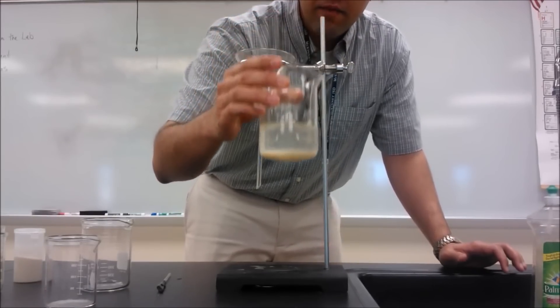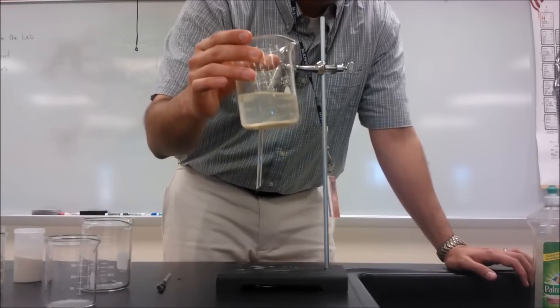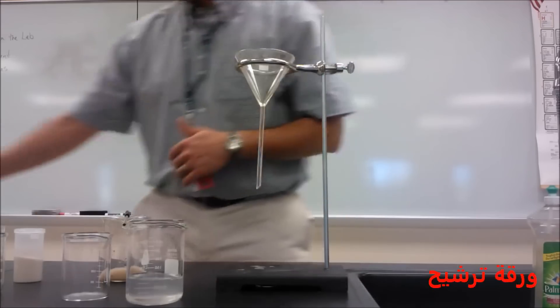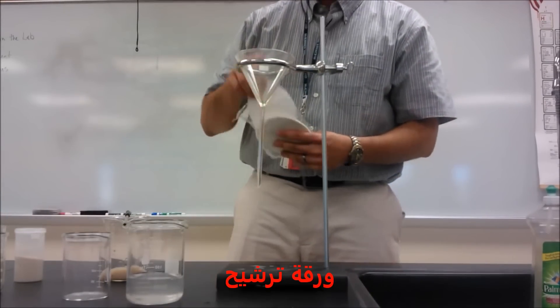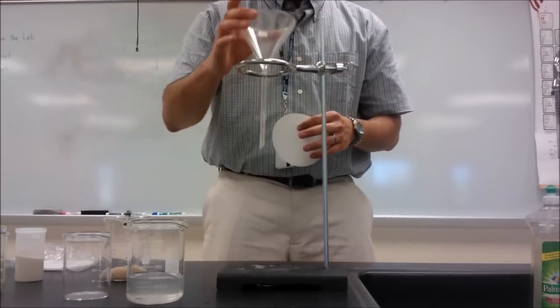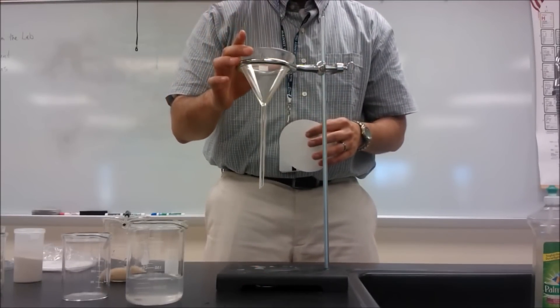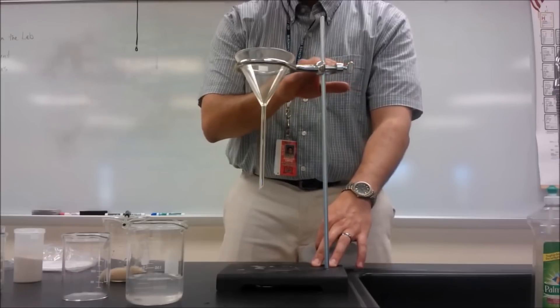So what I'm going to do is the first strategy, the first technique that we can use to separate a solid. To filter, we're going to be using a setup that is going to use some filter paper, and we've got our funnel right here. I've got a glass funnel. Notice that I've got my ring stand with my ring hooked up to it.